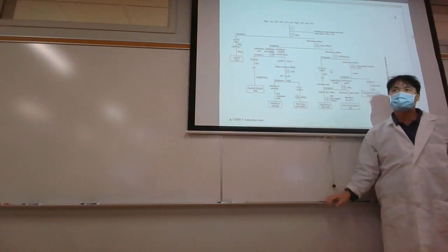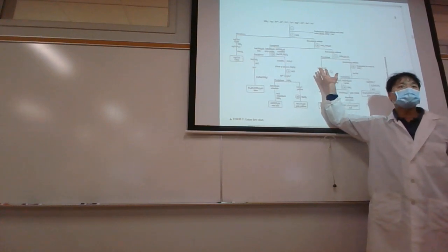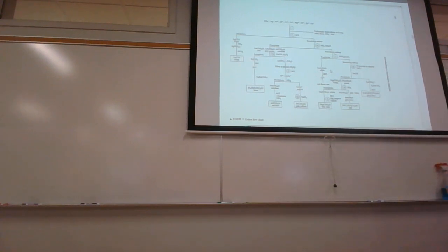A lot of people think, okay, I'm going to do this one-size-fits-all procedure and expect it to work perfectly. It doesn't. So what we're going to do is start off with 10 drops, or a little bit more if you want. Just a little bit more, not too much more, because then we're going to exceed the capacity of our test tube. And then we're going to be very careful how much of the other stuff we add.